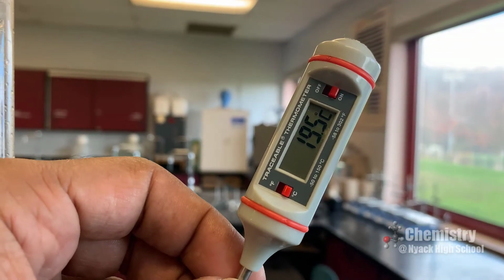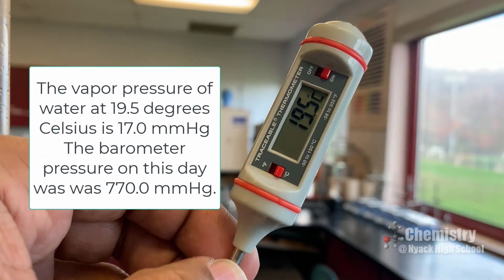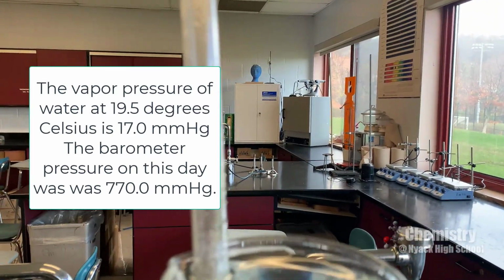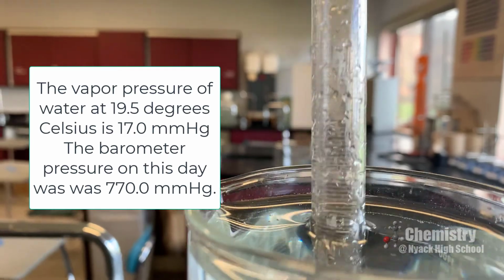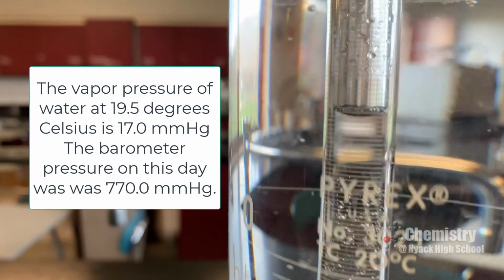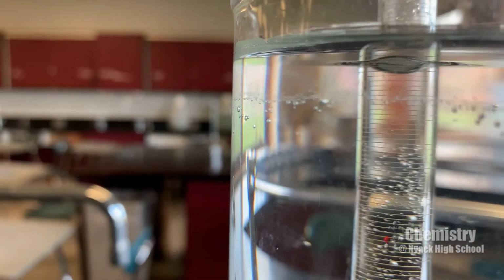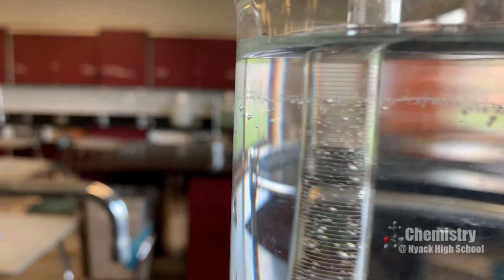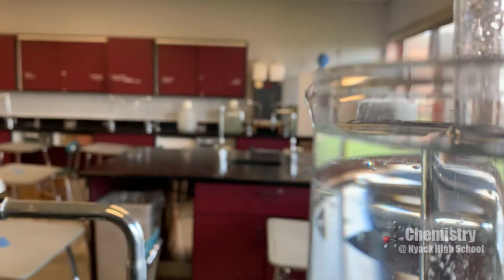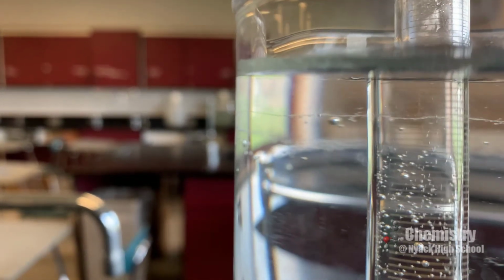The temperature of the water bath is 19.5 degrees Celsius. And at this point, I'm going to measure the volume of the gas inside of the eudiometer. I'm lifting the eudiometer so that the level of the liquid inside the eudiometer is equal to the level of the water inside the graduated cylinder. I'm doing this to ensure that the pressure inside the eudiometer is equal to the atmospheric pressure outside.